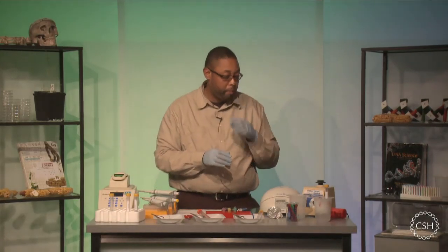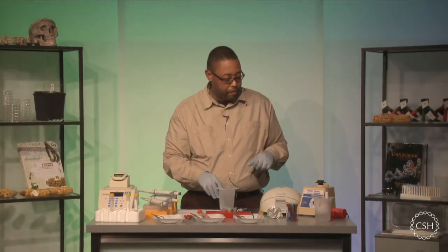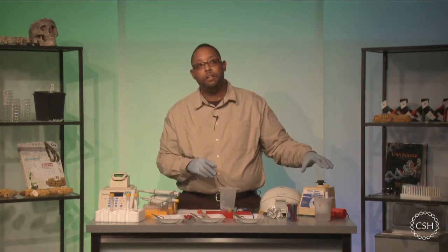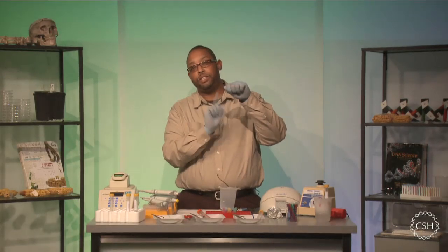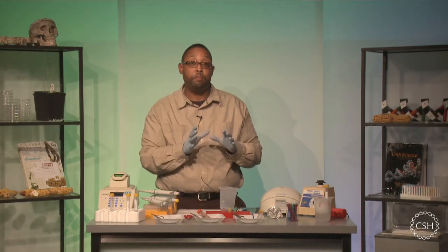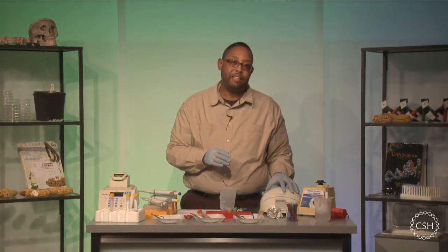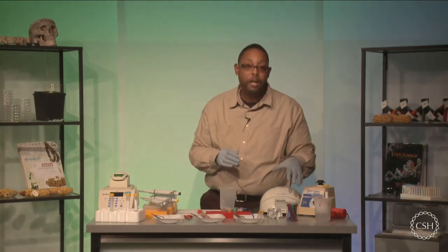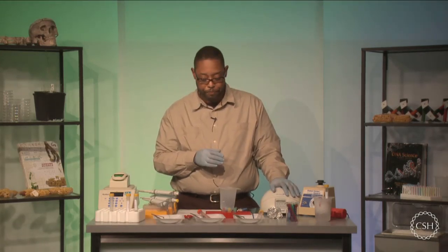Now, some other pieces of equipment that I have over here that are sort of pushed to the back here is I have my vortexer. If you do not have a vortexer, finger vortexing will work just as well. All I want you to do is just basically use your finger to tap onto the test tube, and you'll see me do that as I go through. I'll make sure I demonstrate both methods that are physically there. And then, of course, lastly, I need physically to have a microcentrifuge, and I'll have one here. Doesn't matter which one you have, but we need to be able to spin at least at 8,000 RPM. Okay.